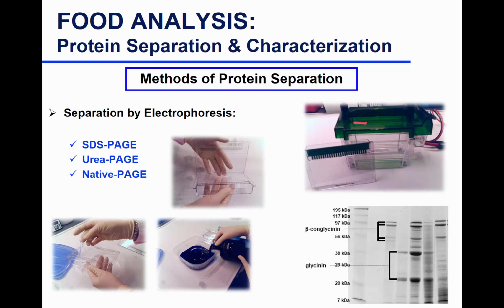Okay, so you ran your gel. Usually your sample is run with a dye so that you get to see the blue mark going down the gel. That's when you know that your samples are going down, because proteins are not colored, so you just put a dye in there. Once all of your sample has run all the way to the bottom, then you take it out and you break it. We have a cool compartment here that's made just to break your gel. That's the favorite part.